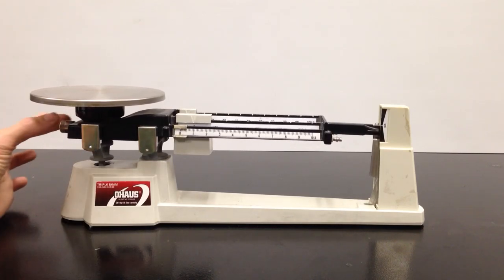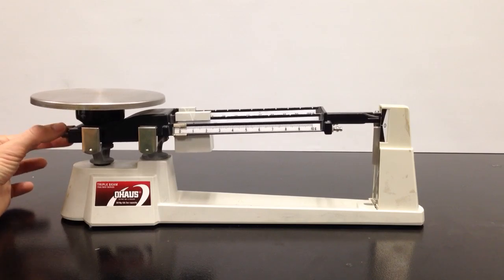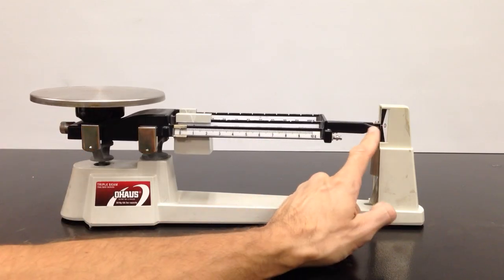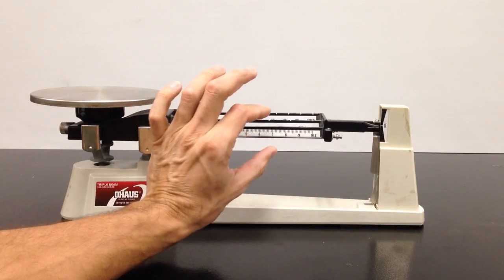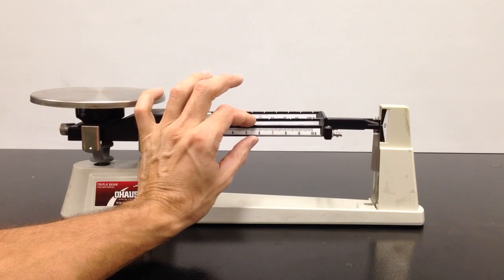This little guy right here is an adjustment knob. Right here is a pointer, and then this is your scale or your zero. When you start out, you want to make sure that your balance is right at zero.